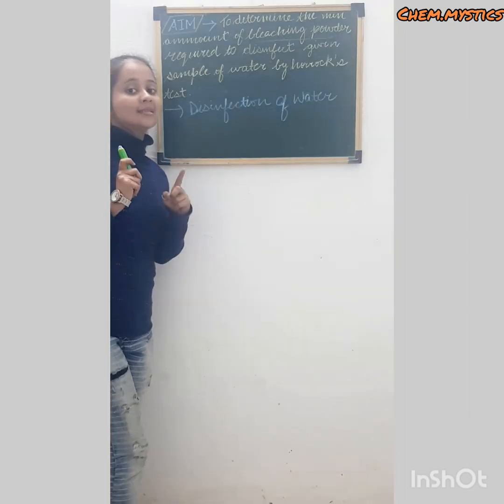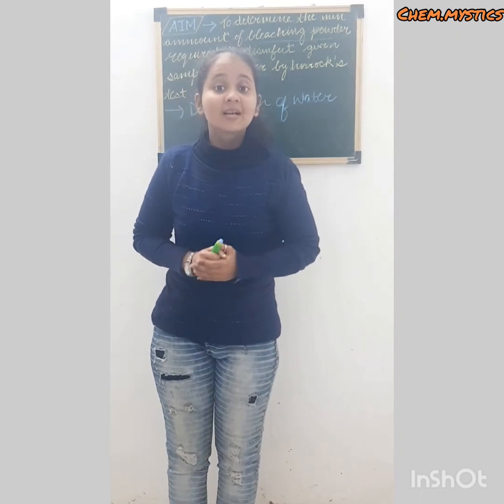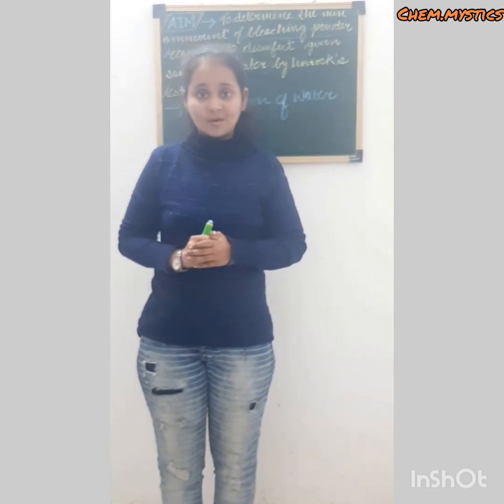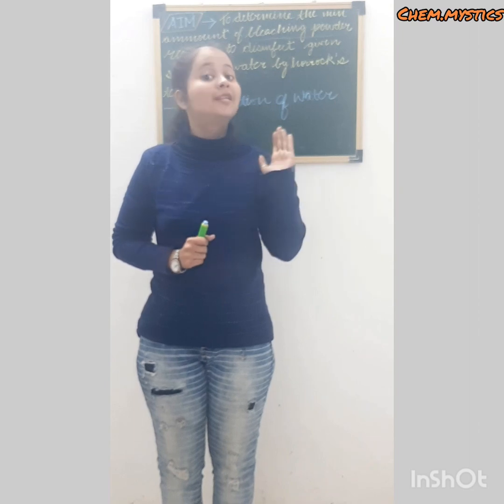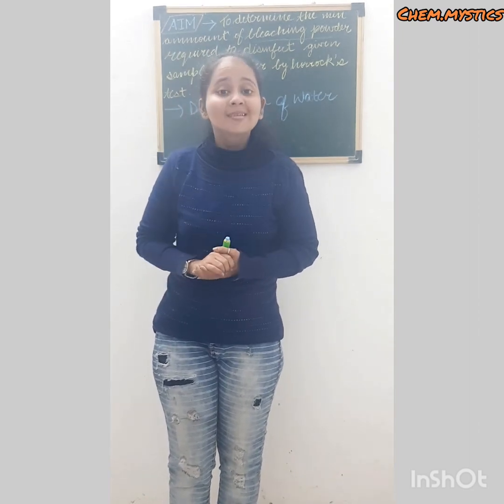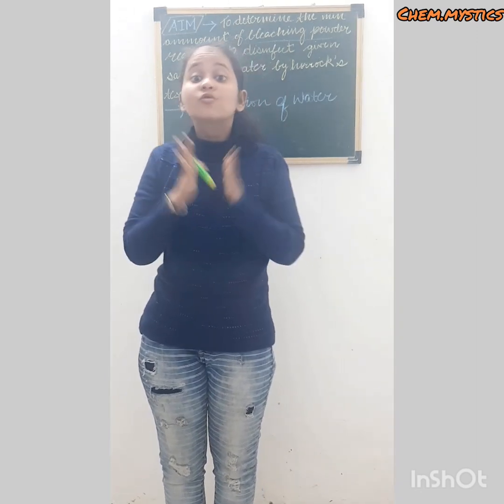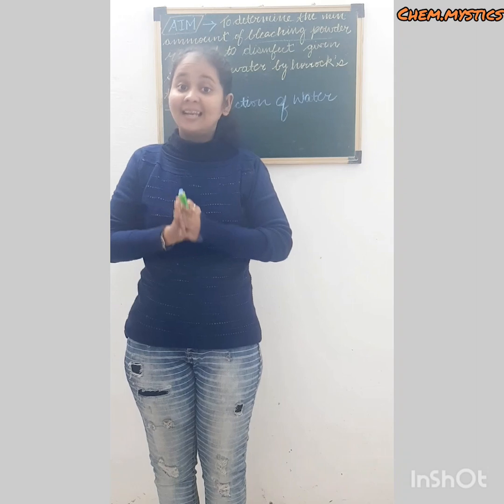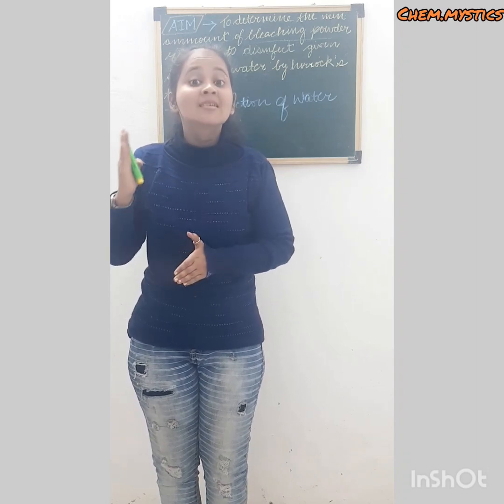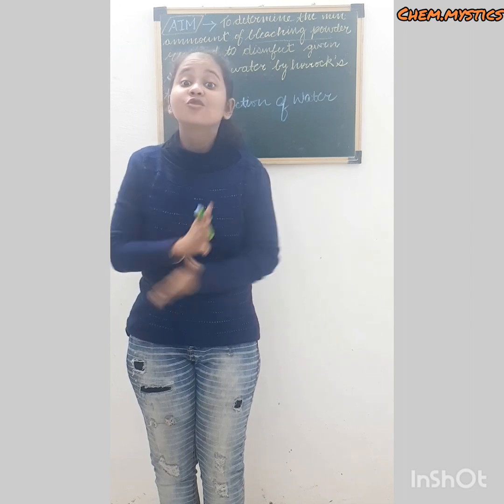See, guys, it is very clear to all of us that water comes from different sources. It comes from different rivers, it comes from different ponds, and this water is usually associated with so many impurities like microorganisms, sand, clay, dead decaying organic matter, and many more.